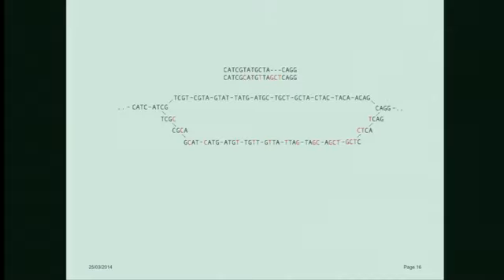So the bottom line is this. I've got two chromosomes, say they're two species up at the top, and I've got in red characters where they differ. And all I want to do is break up the genome into a sequence of words, let the sequence of words create essentially a graph or a network, and look at how those graphs or networks differ between species. So along the top, I get the words that are created by the top genome. Along the bottom, I get the words generated from the second genome, and they create some structure. And if I look for those structures, they're differences between genomes. So if I zoom out, I create this cartoon.